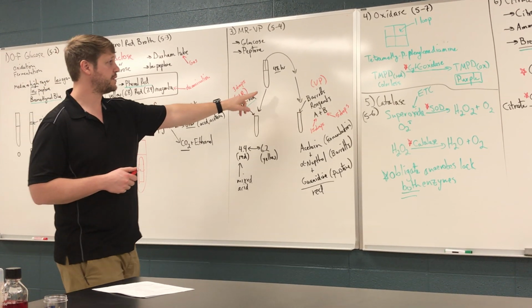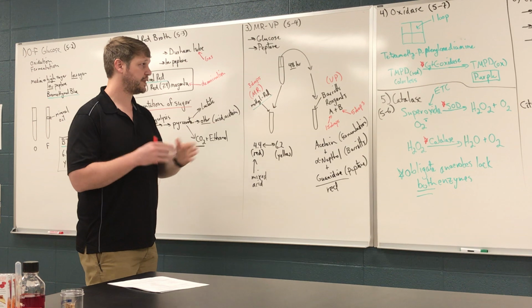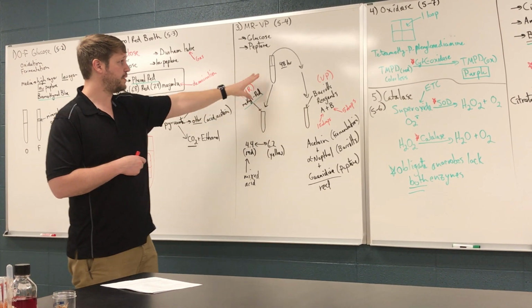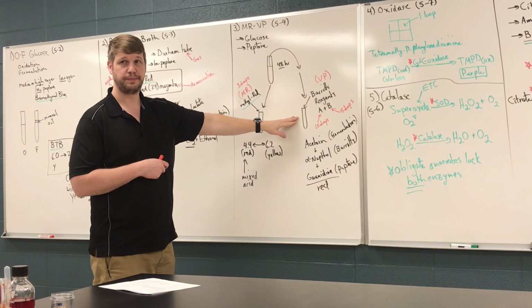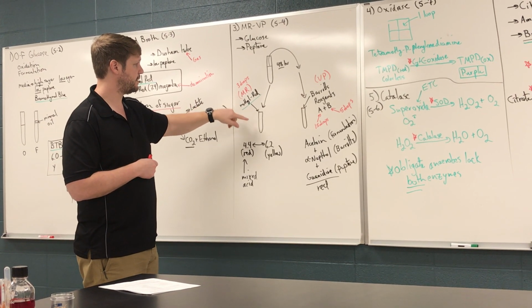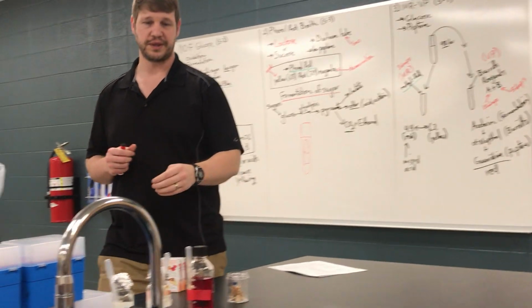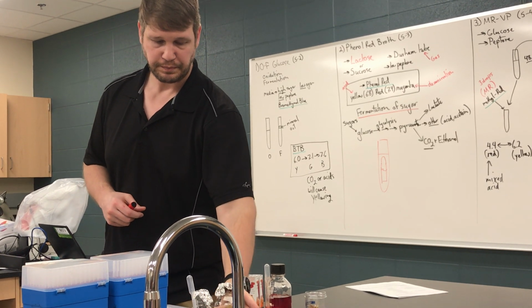After 48 hours, so it is important to give this one a little bit longer. After 48 hours, and it could be even longer than that if you need to, you're going to split this into 2 tubes. So you can leave some in your initial tube and just transfer a couple mils out to a second tube. And to one of the tubes, you're going to add methyl red, and to the other tube you're going to add Barritt's reagents A and B, which are also sometimes labeled VP reagents. So these are here labeled VP reagents.